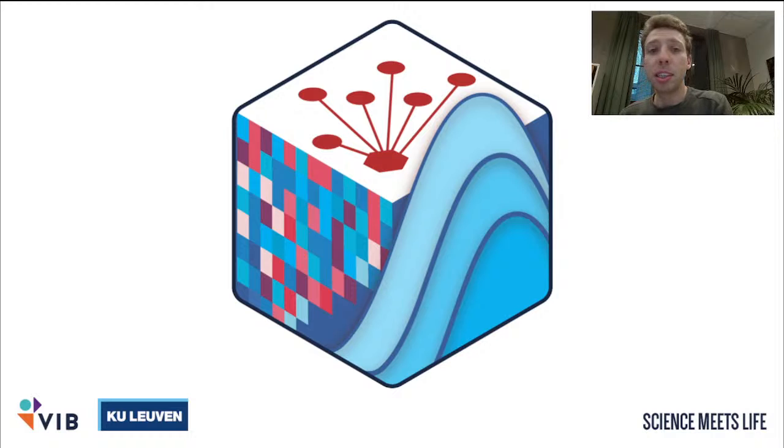So one question is whether the development version is a different but just more efficient version of the original release, and whether you get the same results if you run development versus non-development version. So indeed, it's supposed to be the same pipeline. The functions that are used also have the same purpose. So the results should be similar, but I cannot guarantee that it's 100% the same. But in general, the results should be similar enough.